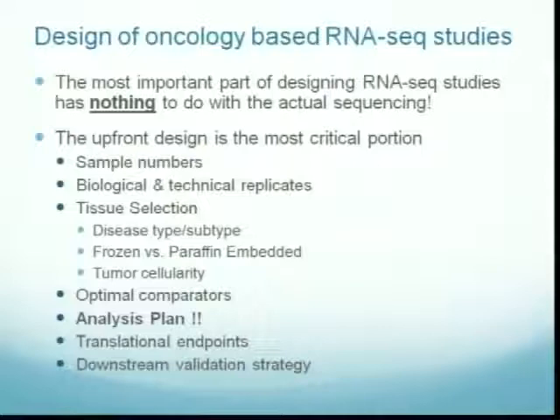It is my opinion that the most important part of designing RNA-seq studies has nothing to do with the actual sequencing. I think that's a really important part that people forget. The upfront design is the most critical portion. A lot of people will work too fast on upfront design, get done with the sequencing, and then go back and say, oh my, I should have done this. So I think a lot of time spent on the upfront design is key to your success.